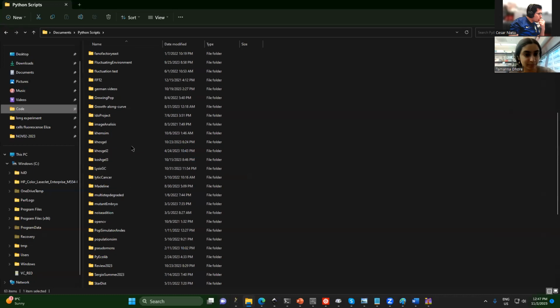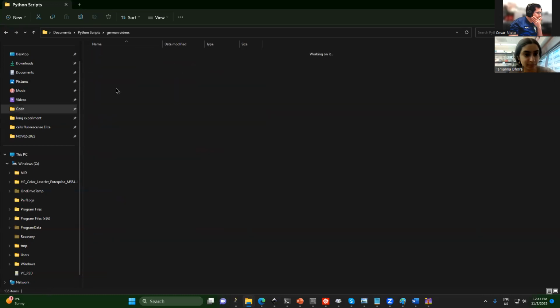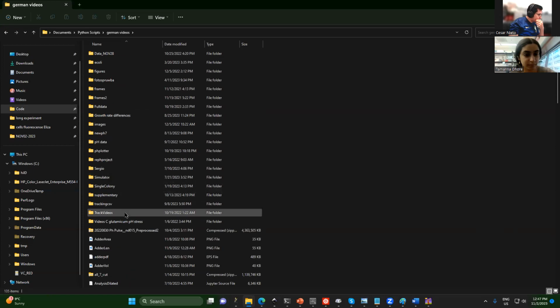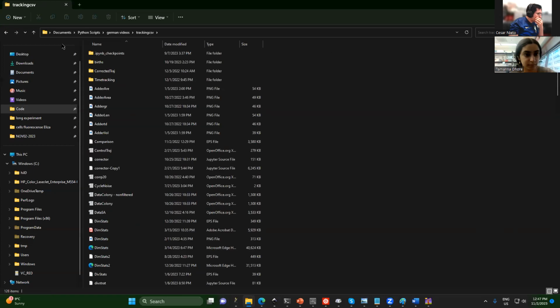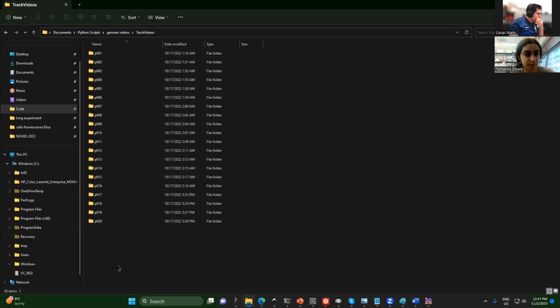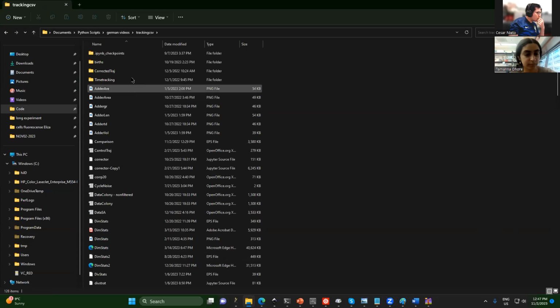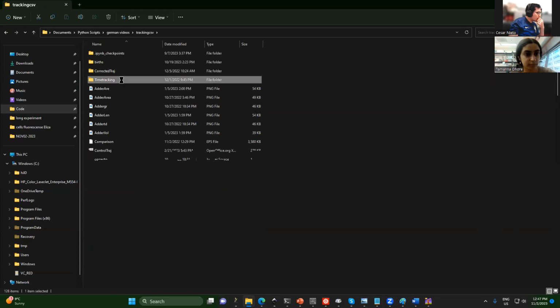I didn't have time to learn new things. So let's see, for instance. This is based on Python, and it gives you something like this.